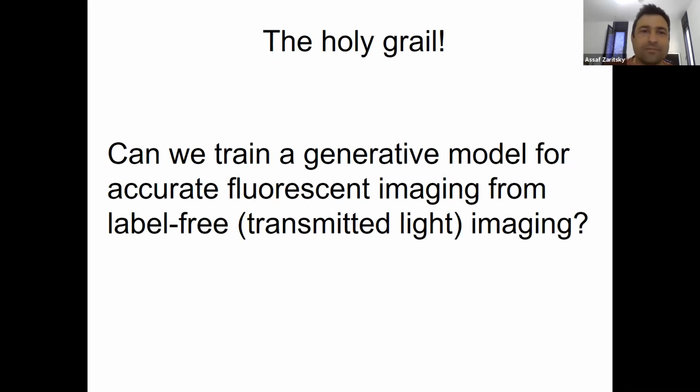So, I told you that we cannot image many organelles in the same living cell. There are other initiatives. I think I'll have a lesson about public data sets, and I'll tell you what each data set is and what it is good for and what people can do with it, but not now. Because I just remembered two other data sets that I didn't mention.